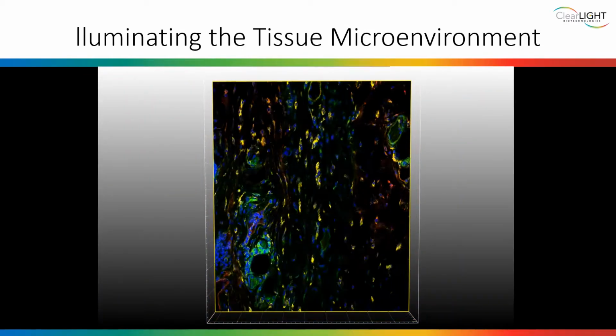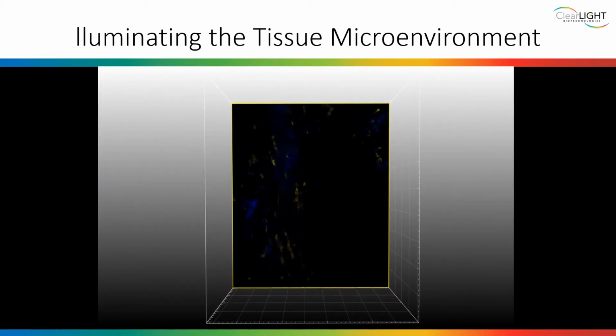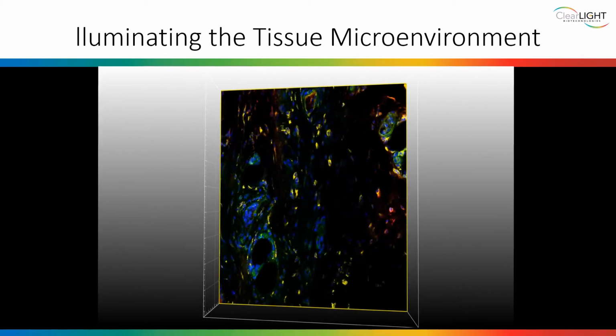Yesterday's science fiction is becoming science fact. It is now possible to trace the path of a single nerve projection through a forest of other cells. Researchers can illuminate the tissue microenvironment in a 3D volume.